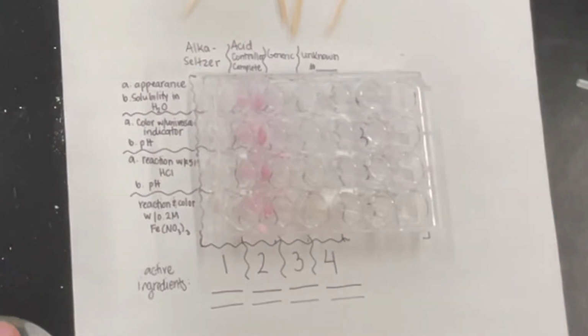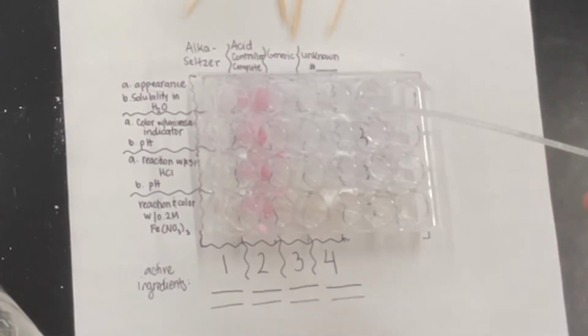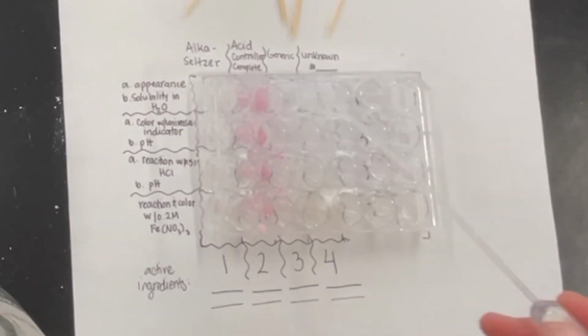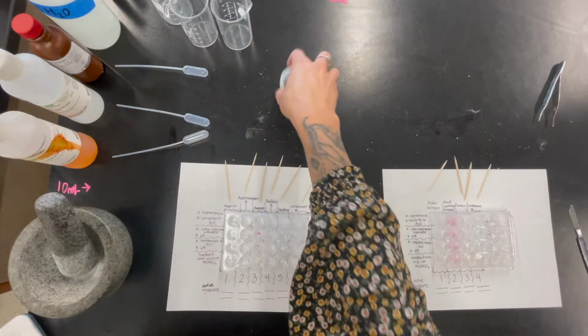Ooh, you hear that fizz? All right, so these two fizzed audibly, like I could definitely hear it. So that was an interesting reaction there. Definitely something to keep note of. So that was our deionized water reaction here.